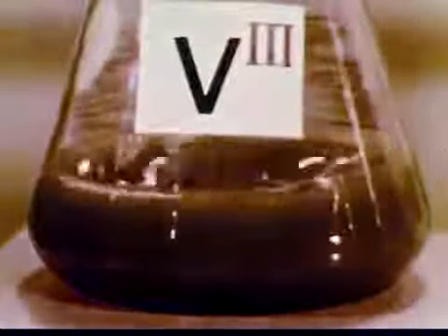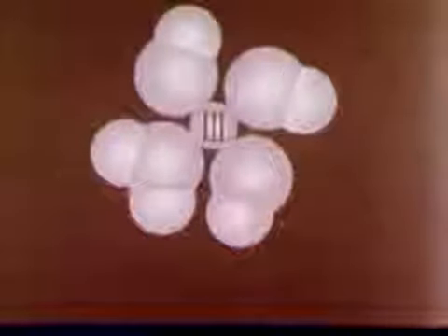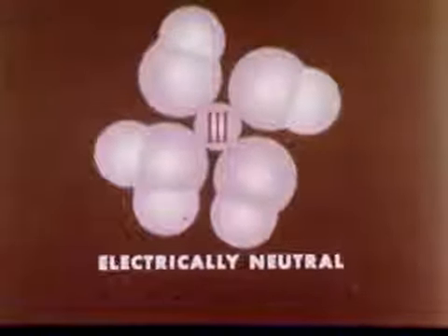But what is happening on the molecular level? At the start of the experiment, the vanadium-3 ion is strongly bonded to water molecules, 4 of which are schematically shown here in 2 dimensions. The positive vanadium repels the hydrogens. The added hydroxide ions remove hydrogen ions from the water molecules, leaving hydroxides bonded to the vanadium. This combination of negative hydroxide and positive vanadium lowers the positive charge of the aggregate. The precipitate forms when the aggregate becomes electrically neutral.